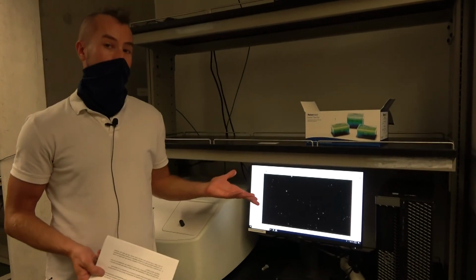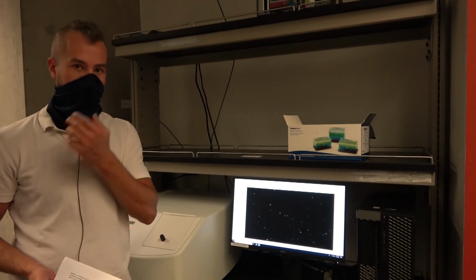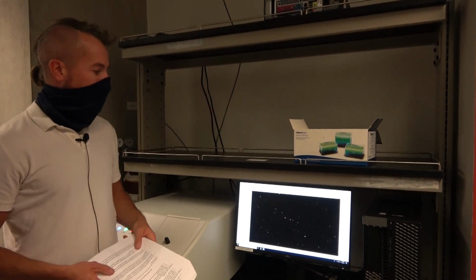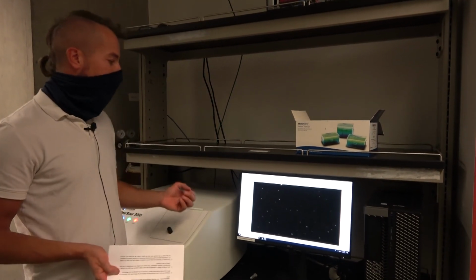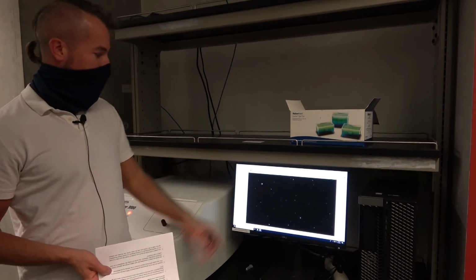So I just think this is really neat. I hope you do too, that we're imaging these particles in real time. We don't have the resolution of electron microscopy, but they feel kind of alive. And so this is a really neat technique.